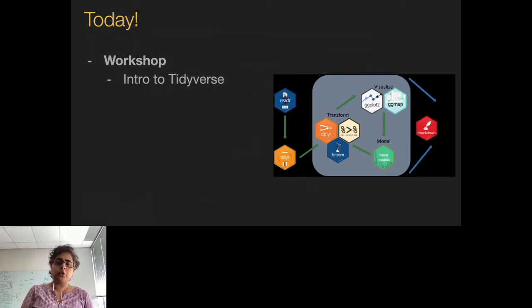So today, what we are going to focus on is the suite of packages, Tidyverse. It's beautiful. It's very elegantly written by Hadley Wickham & Co. So it has multiple packages. There are packages to read, import, and export your data. There are ones for tidying up your data. I'll tell you in a little bit what I mean by tidy data. And then there are a few packages for data wrangling and data transformation. Then there are a few packages for data visualization, which is really the fun part of R.